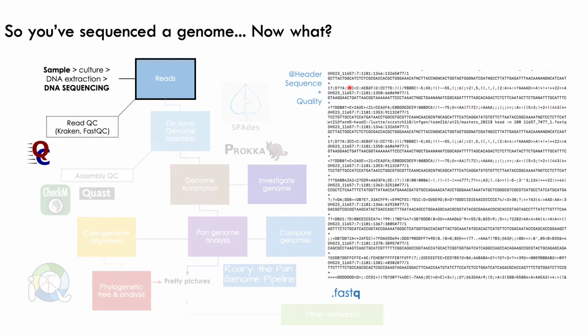So instead, what's used is letters, numbers, and characters. We've got A to Z, and then numbers, and then characters. You can see here I've got the direction, and I've got a really high quality A at this position, and then we've got a really low quality score here. The base caller actually couldn't tell if it was an A, T, G, or C, so it's called an N and assigned a low score.